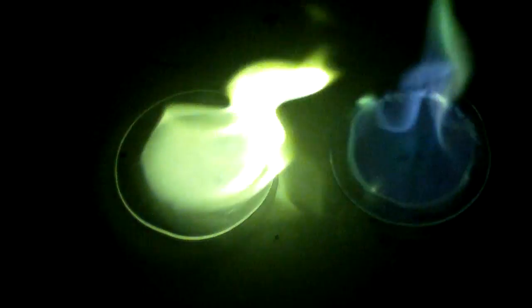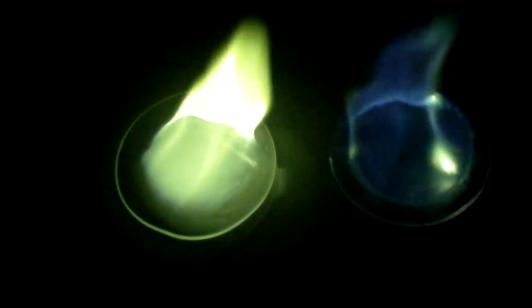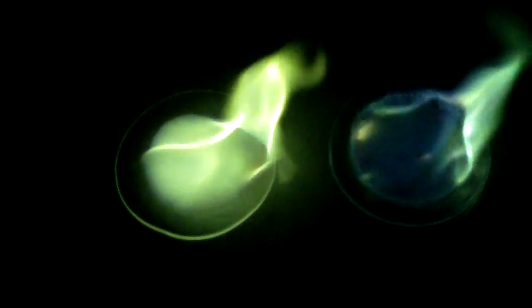The boric acid is immediately burning green because there's a chemical reaction that occurred. The copper sulfate will change color shortly — it just takes a second. The boron flame can be described as emerald. And now you can see the copper color coming through. The copper is a little bit darker than the boron.